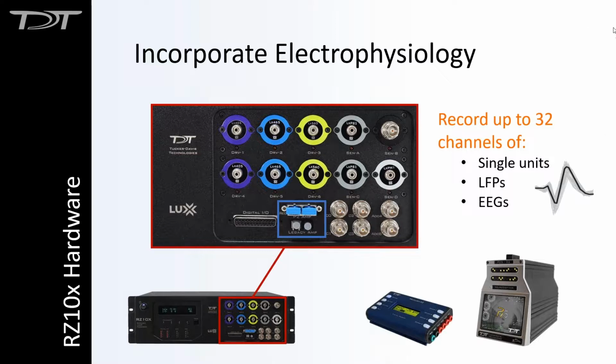Are there any other questions? Yes. Can you describe in more detail how the RZ5P can be upgraded? What is added and what is only available with the RZ10X?